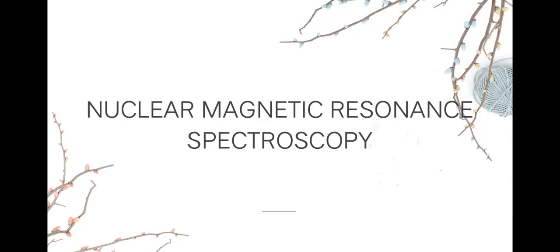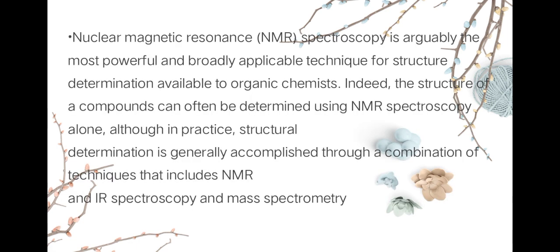For Chapter 15, it is about nuclear magnetic resonance spectroscopy. So first, what is NMR? NMR is nuclear magnetic resonance spectroscopy. It is the most powerful and broadly applicable technique for structure determination available to organic chemists. Indeed, the structure of compounds can often be determined using NMR spectroscopy alone.